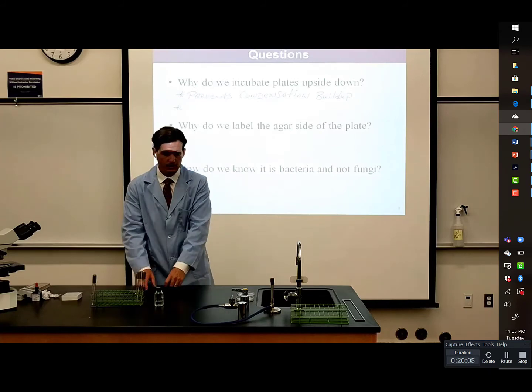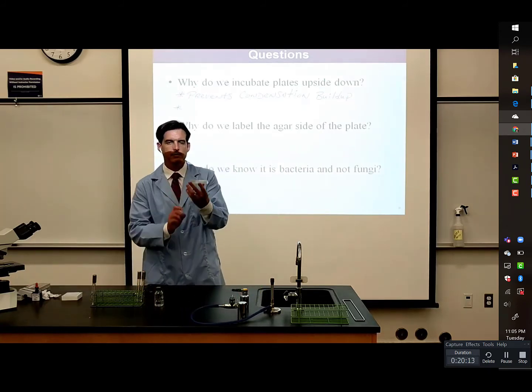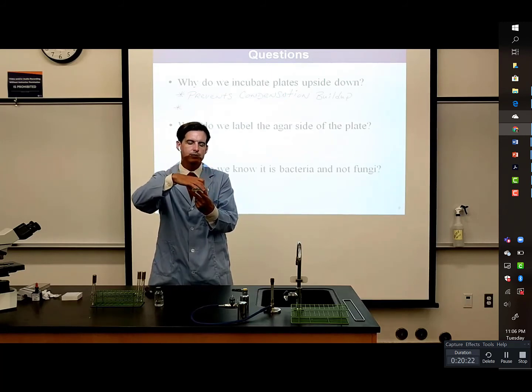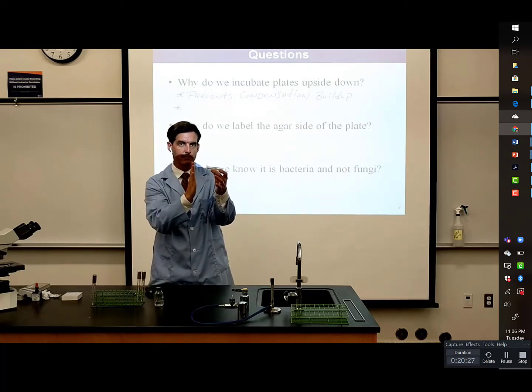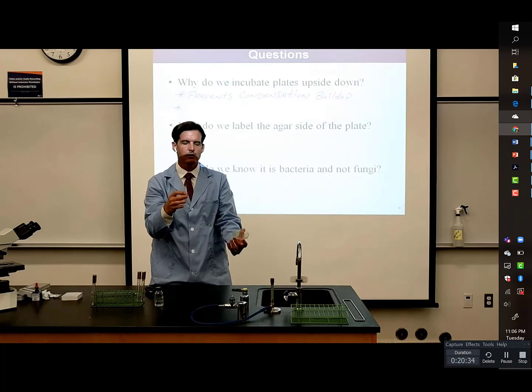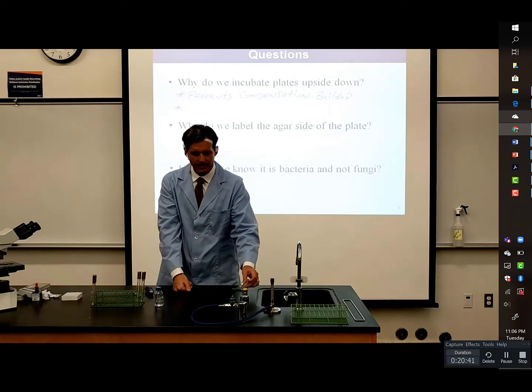To give you a bit of an example, if I have a stack of plates and the lid is face down, it's easier to grab the very bottom lid on a stack of 3 or 4 or 5 plates than if they're right side up, because the lid is larger, like an umbrella, and as you grab the stack, you could end up lifting the lid off and leaving the smaller bottom down on the counter, if you're following what I'm saying.